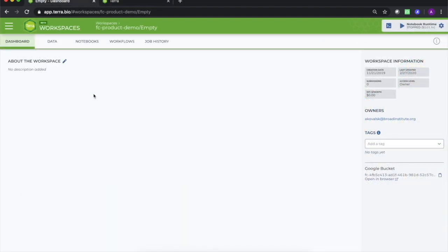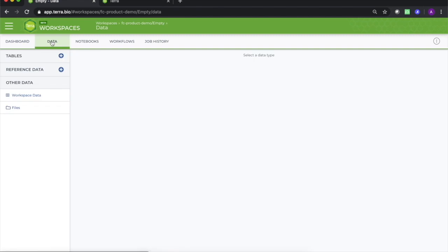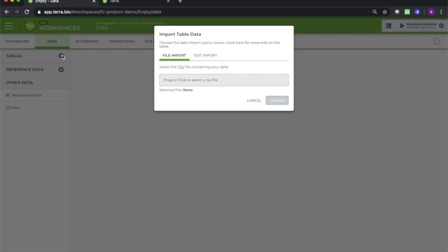In the Data tab, click the plus icon next to Tables on the left, and this will call a pop-up prompting you to upload a .tsv file. It must be in this tab-separated value format to work, so if you're creating a spreadsheet from scratch, make sure you use a program that can output this file format.